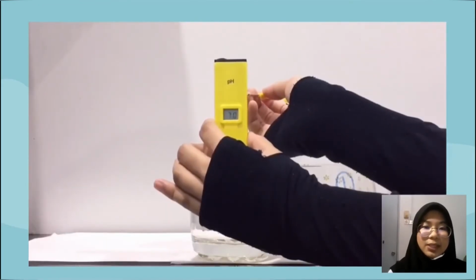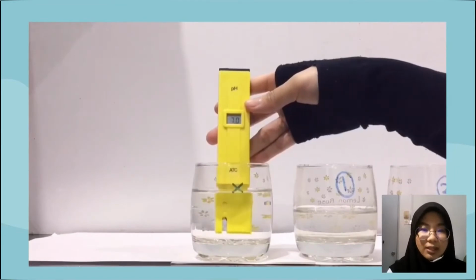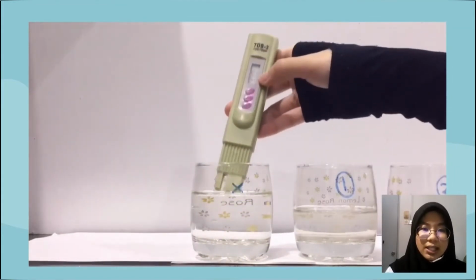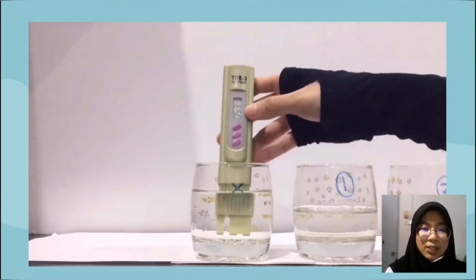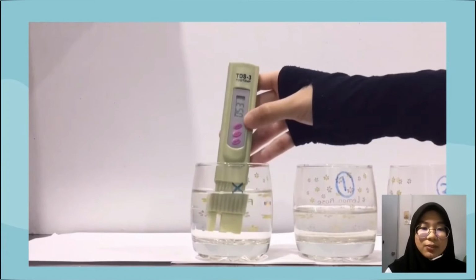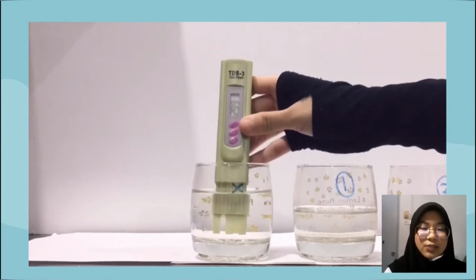Then calibrate the pH meter, record the pH value, and also the TDS in parts per million as units, and also the temperature in degrees Celsius. Record the data for every sample.